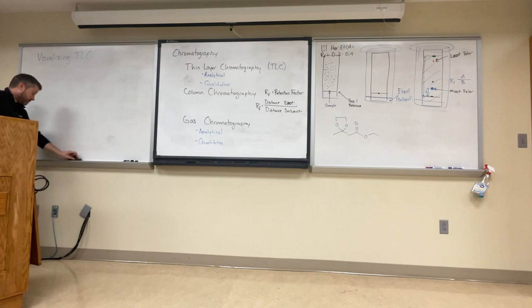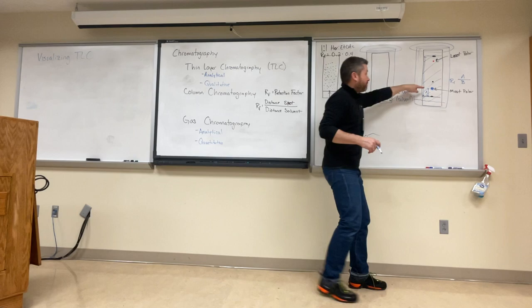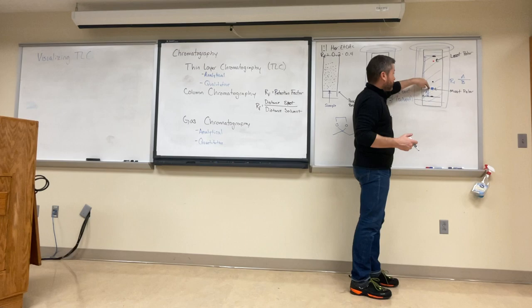Rather than putting something in with the sample beforehand, we can take the TLC plate, knowing that our molecules are still on that plate, and react those molecules with something after the plate has developed. After we develop the plate, those molecules are still there. They didn't go anywhere, they're just sitting on silica. So we can technically take reagents that would react with those molecules, squirt them on the same spot, and they'll react with those molecules.